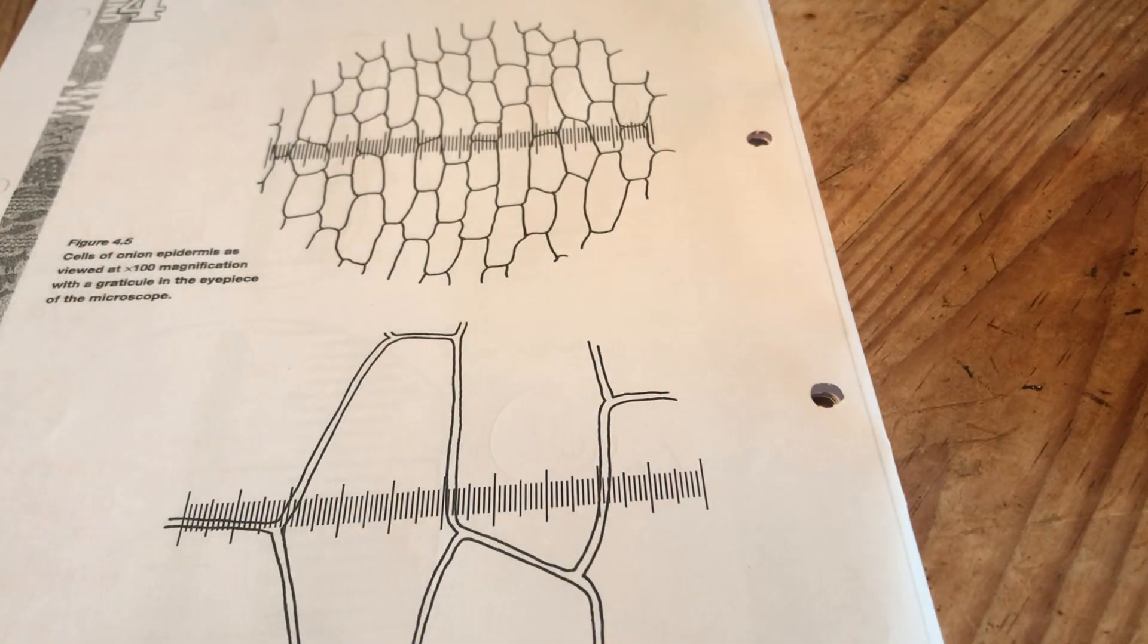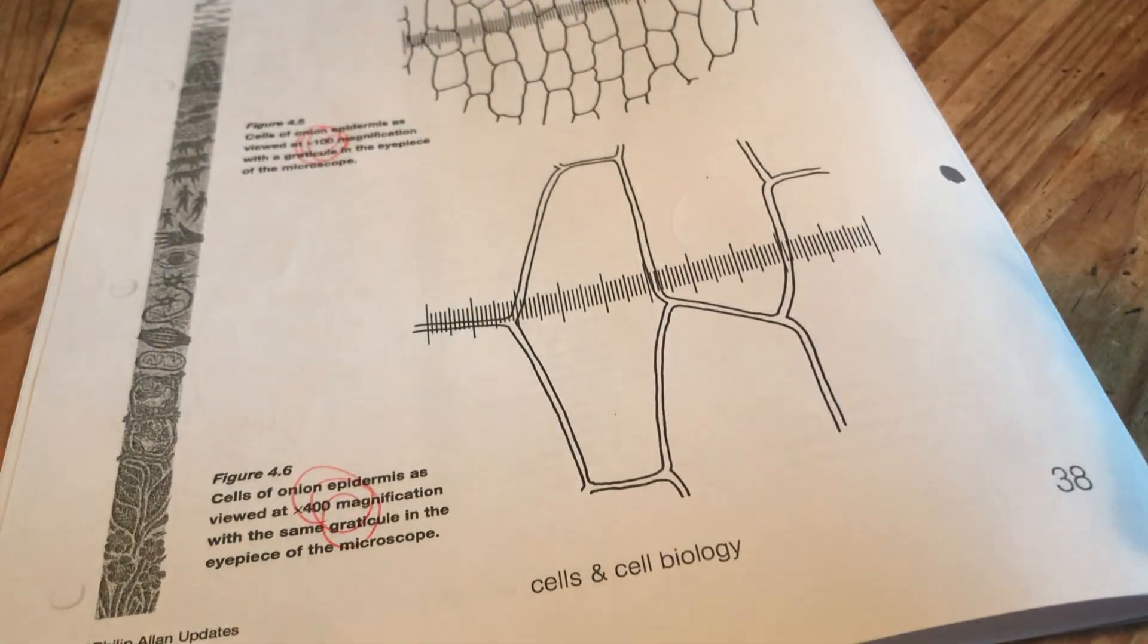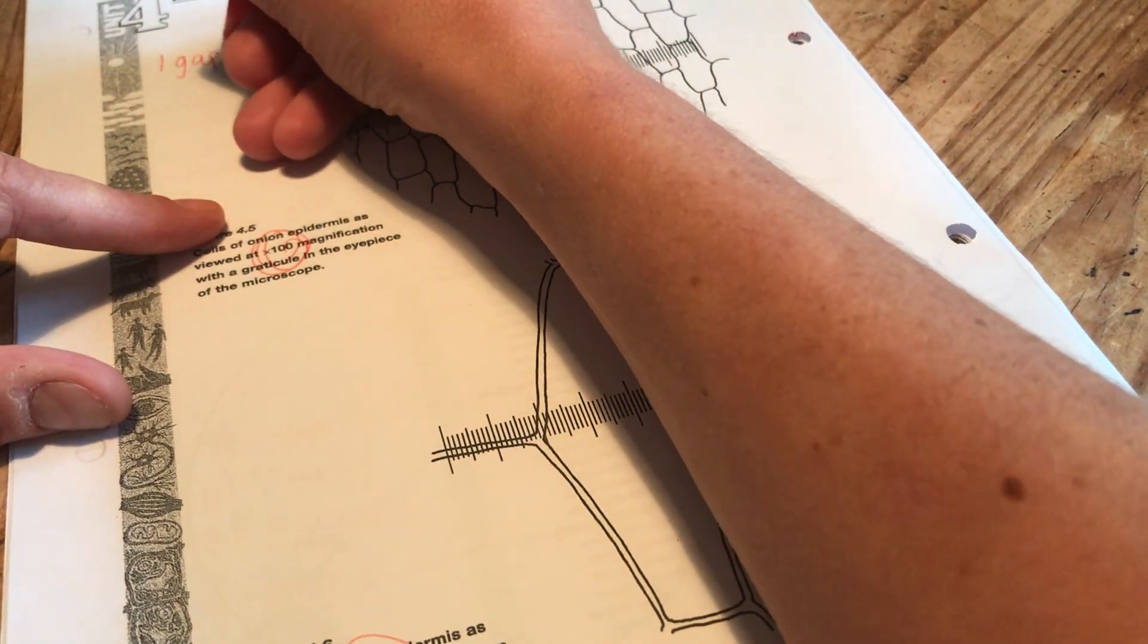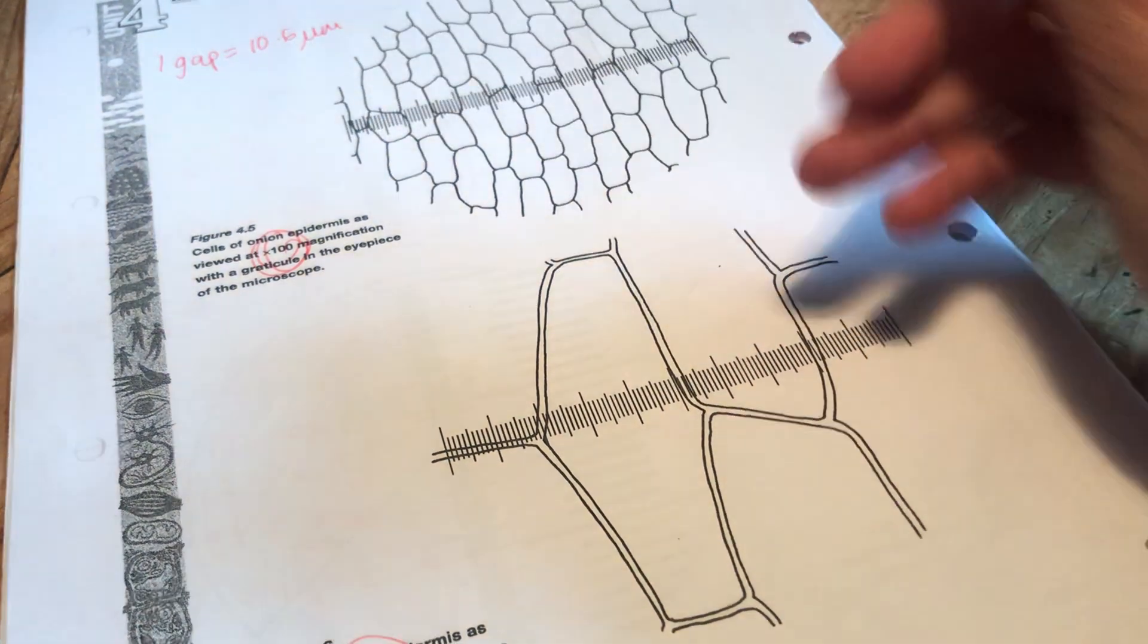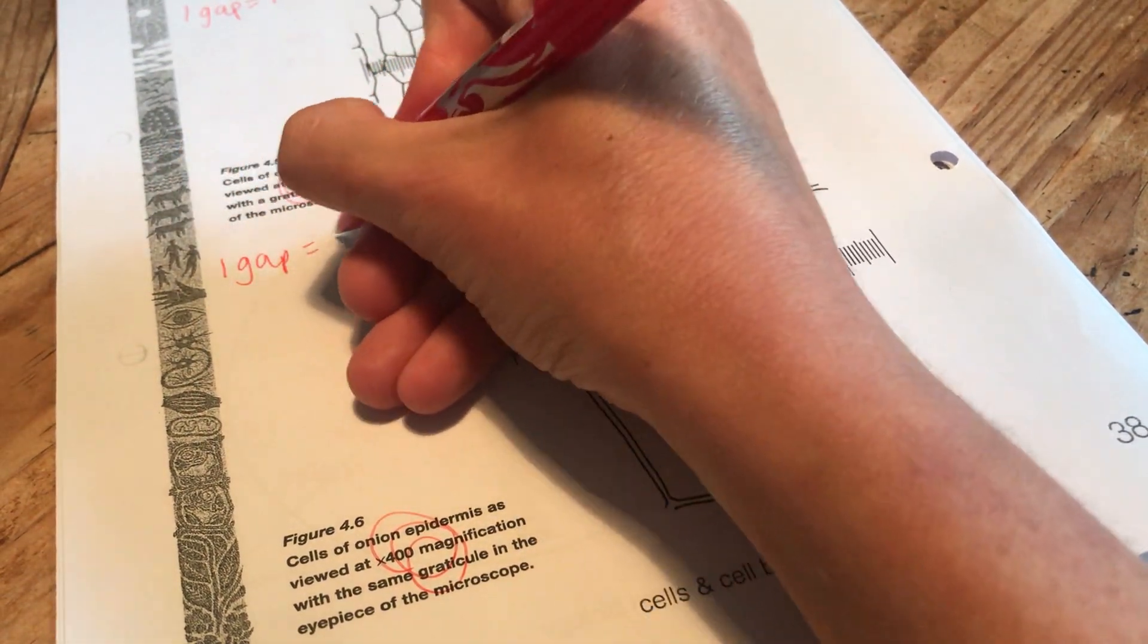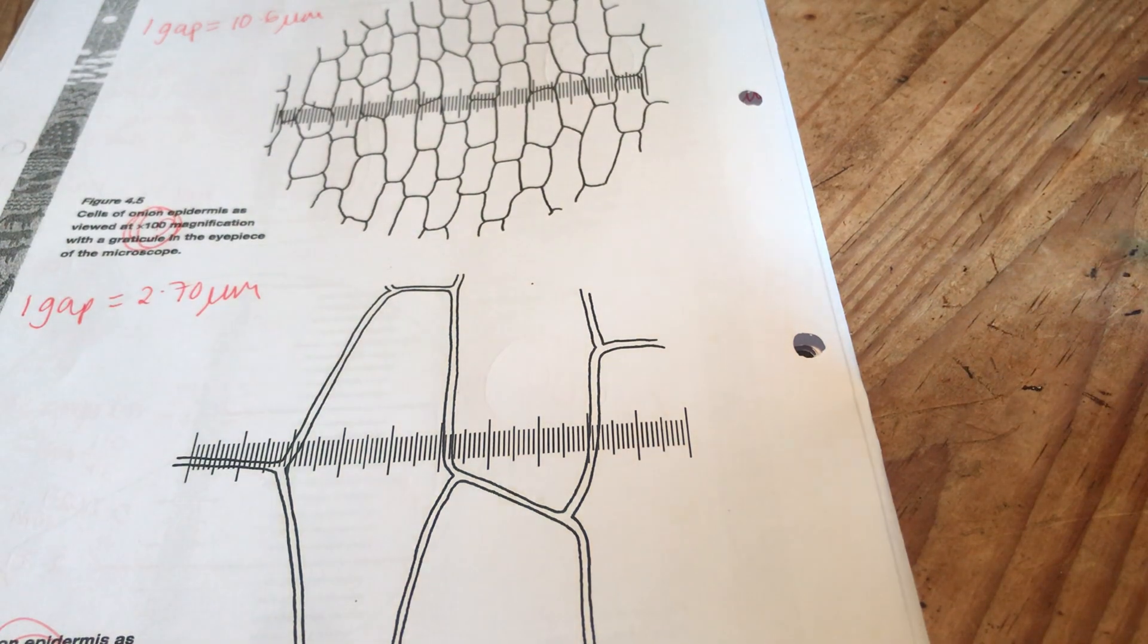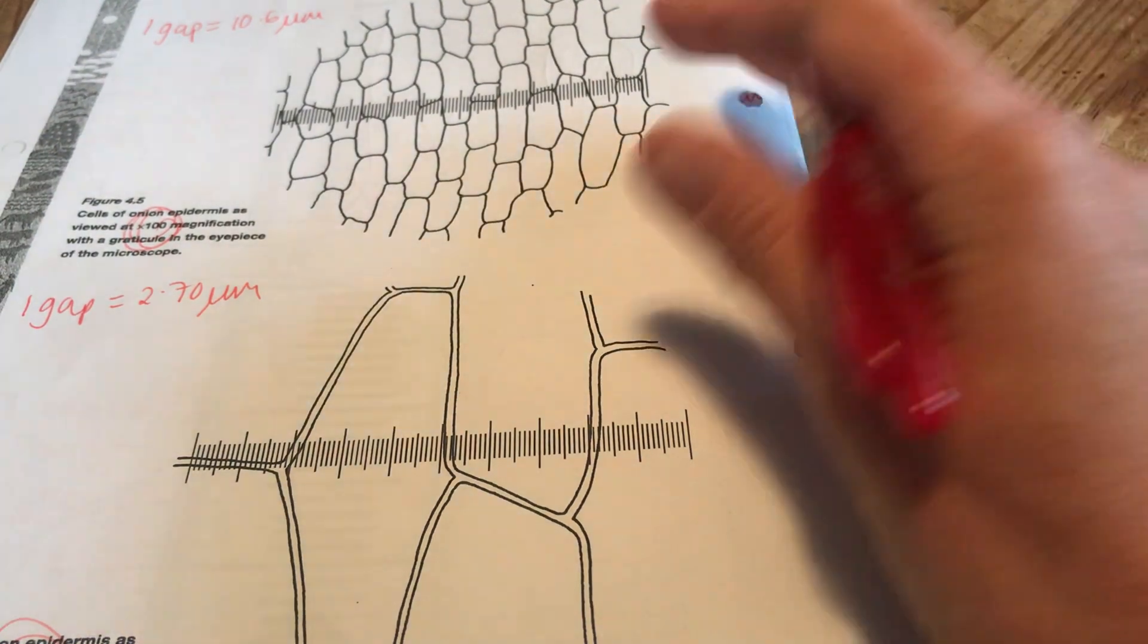So we need to do the width at 100 times and a width at 400 times. So we need some facts to start with. I need to recall at times 100 and times 400 how big those gaps were. So I think we said at times 100, one gap was worth, looking on my other sheet here, 10.6 micrometres. And I think we said at 400, one gap is worth 2.7 micrometres. Now are we asked for a mean here? We are aren't we? Calculate the mean width of one cell. So we should do a couple and take an average or we do the whole length and do an average that way. So there's two options.